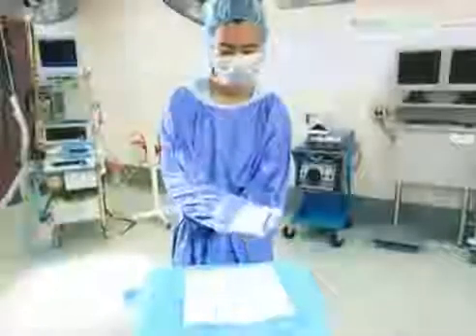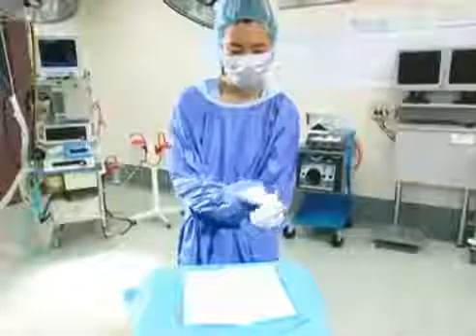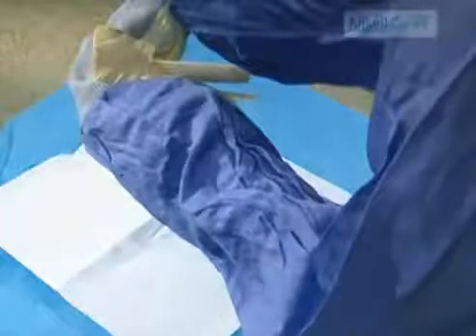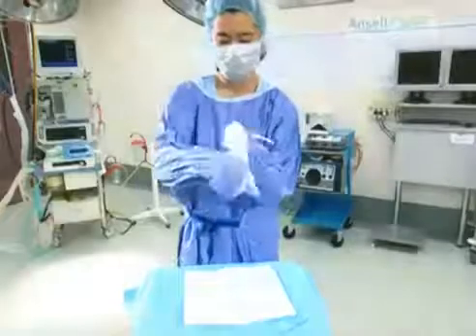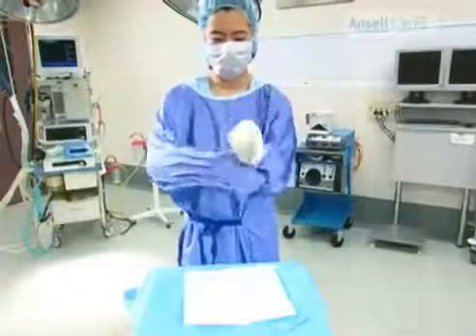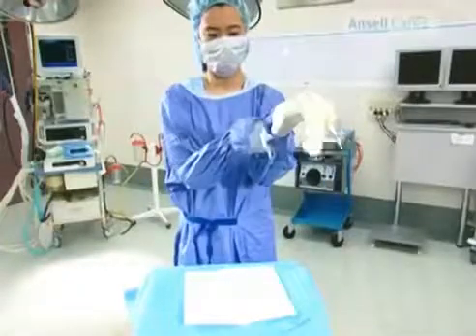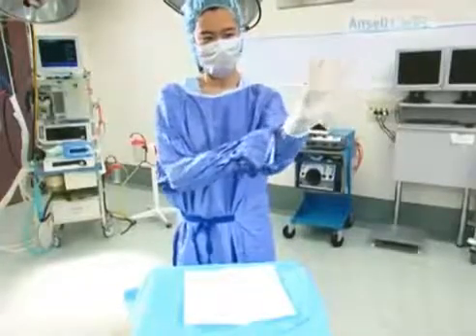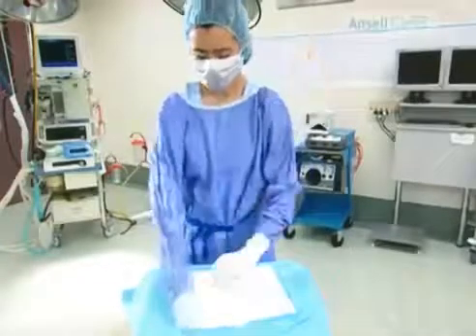In your left hand, from the back of the glove, grasp the cuff of the glove and gown together. With your right thumb, grab the front of the cuff and pinch. Pull the glove cuff out, up, and completely over the gown cuff. Slide and wriggle fingers into the glove. Repeat for the other hand.